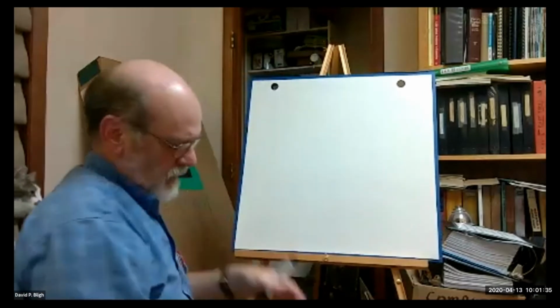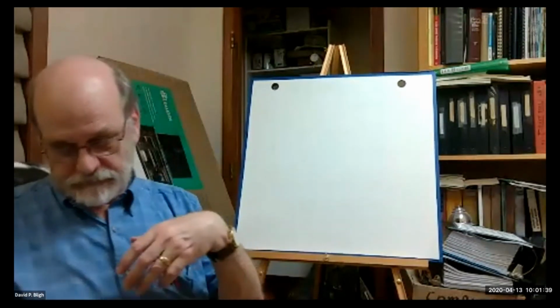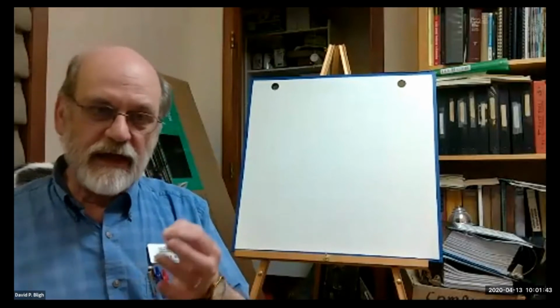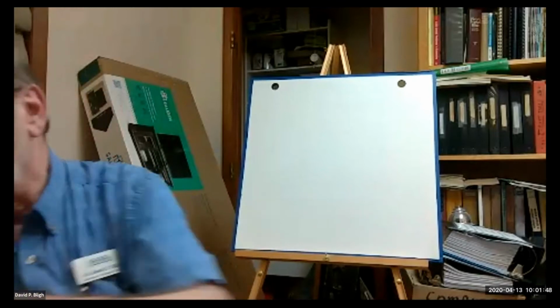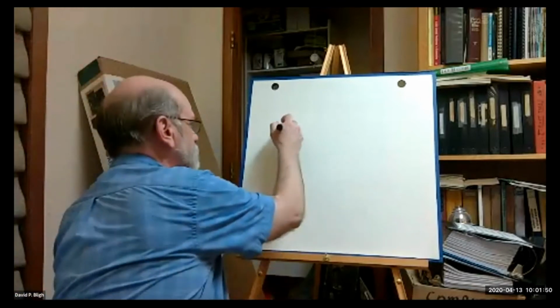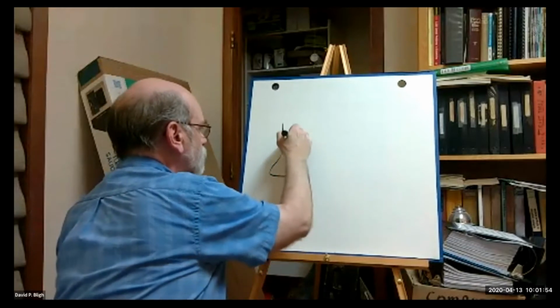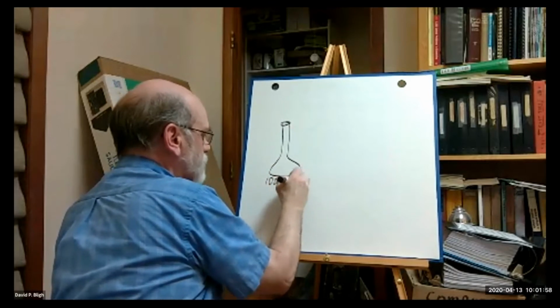All right. So, in this experiment, if you were doing it hands-on, you would need a volumetric flask of exactly 100 milliliters.